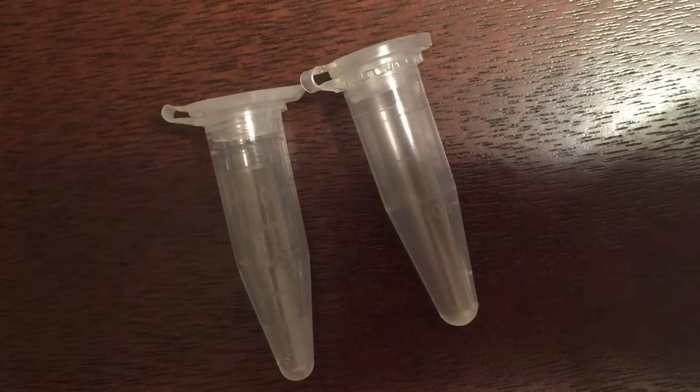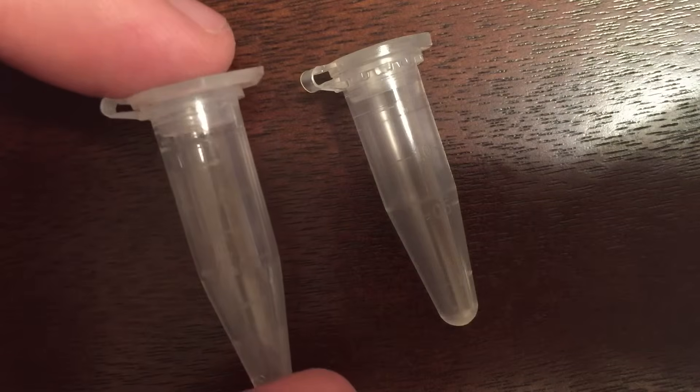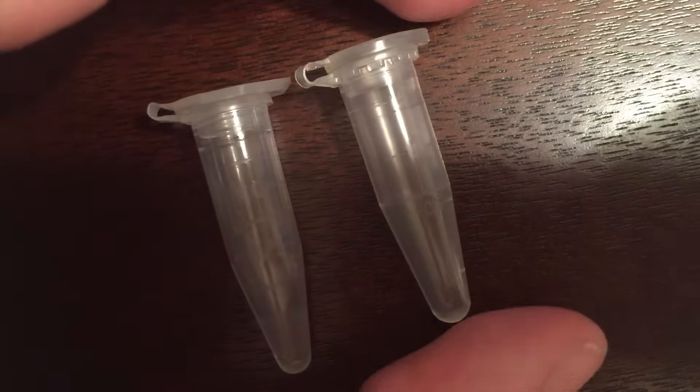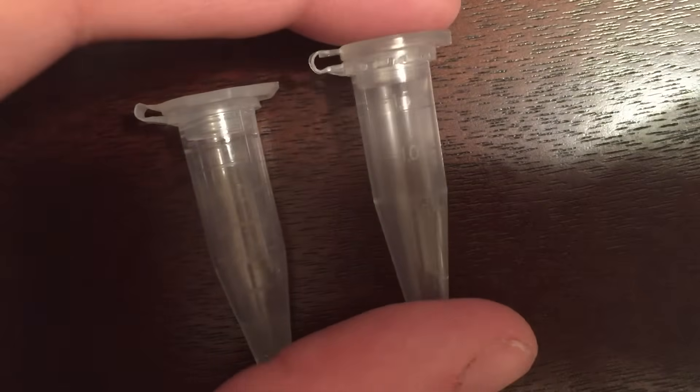Furthermore, if you have applications that require boiling or autoclaving of a volume at 1.5 milliliters, you might have some spillover if it's put in the smaller tube, whereas the Brandtek tube on the right has some extra room for those applications.